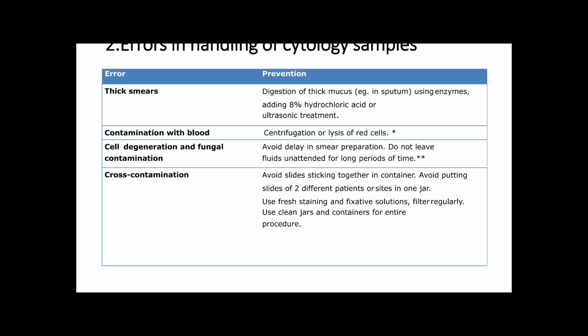So, how to prevent? Avoid slides sticking together in the container. Avoid putting slides of two different patients in one jar. Use fresh staining and fixative solution. Filter regularly. Use a clean jar and container for the entire procedure.